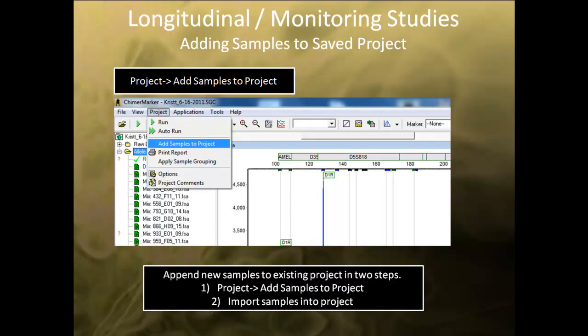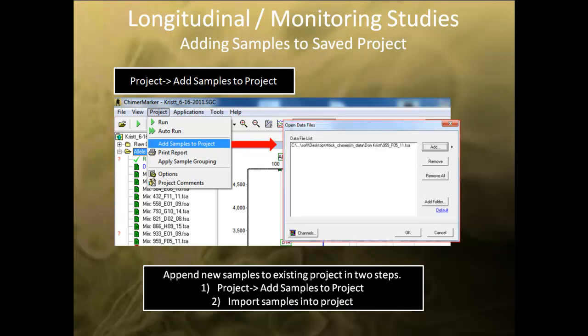You can easily append new samples to a saved project in a few easy steps. First, open the project by going to File and selecting Open Project. Second, go to the Project tab on the main menu toolbar and select Add Samples to Project. An Open Data file dialog box will open. Simply import the sample you wish to add using the Add button and navigating to the sample. Once added, the sample will be automatically genotyped, chimerism typed, and quantified when single donor chimerism is selected in the application window.